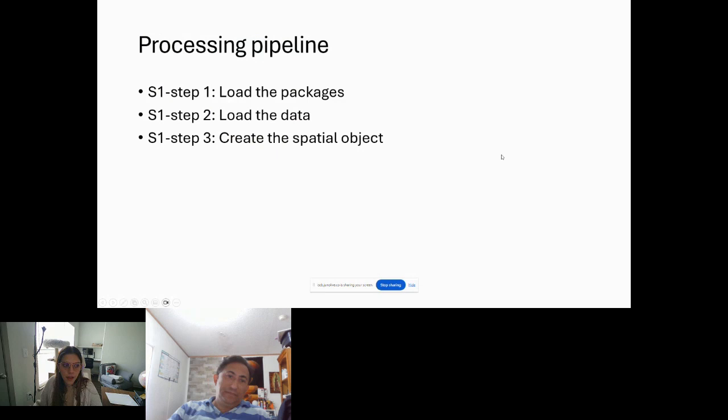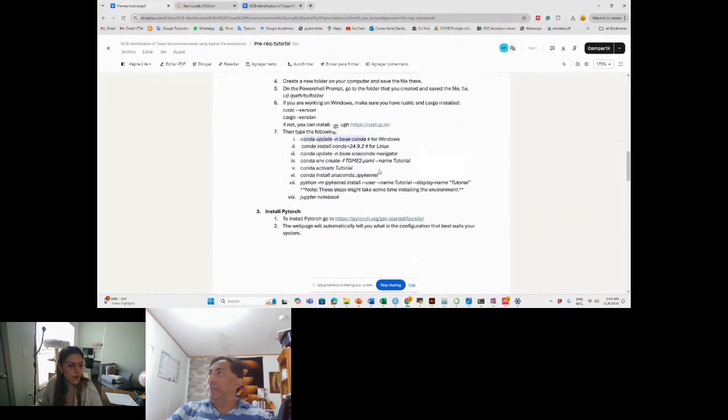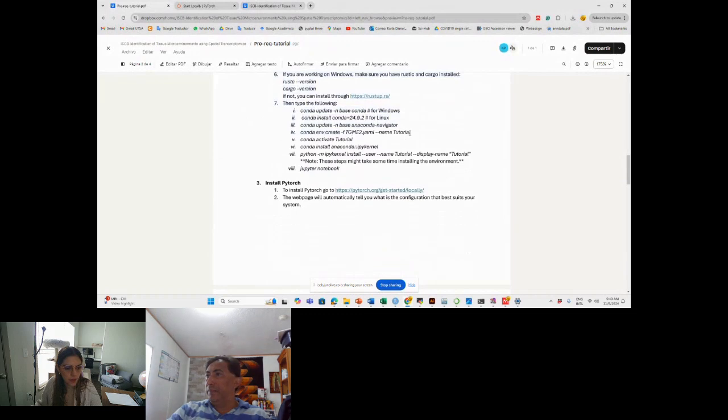Yes. Go through the steps that you mentioned of conda activate and all this so that they can do the same. So here, after you install the environment, you will have to activate it, install ipykernel, and then generate the tutorial environment from ipykernel, so you will be able to visualize it in the Jupyter Notebook. After that, you will type jupyter notebook, and then it will open. Okay?